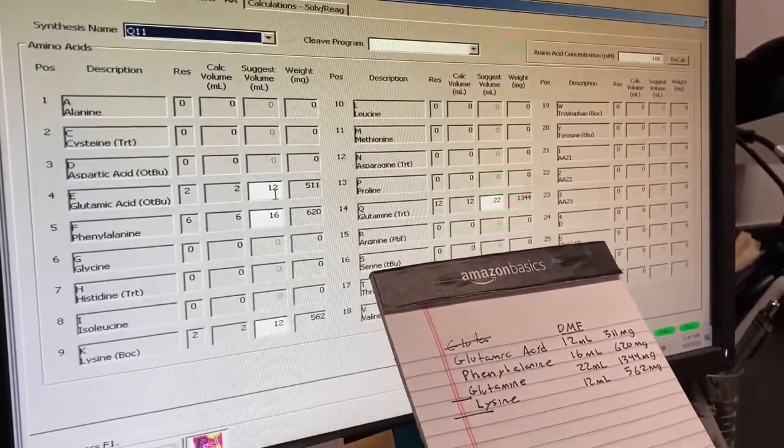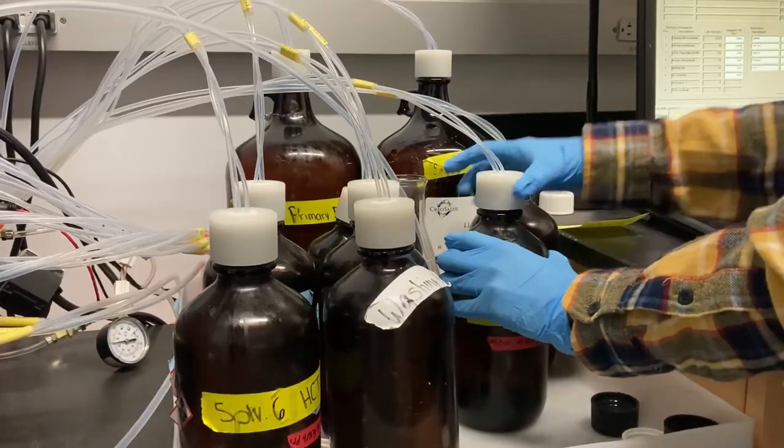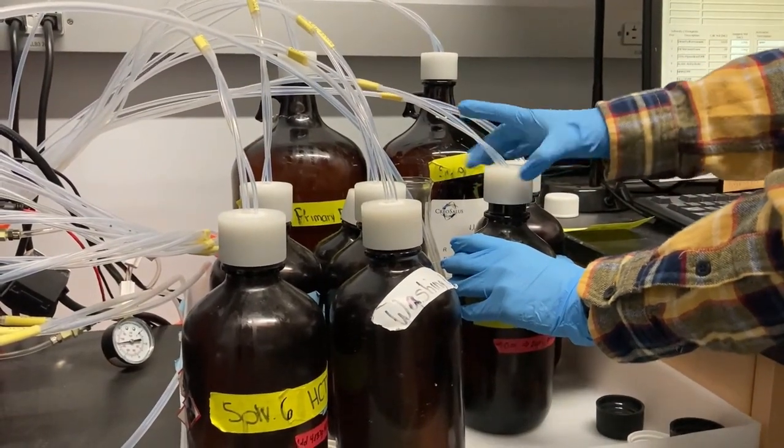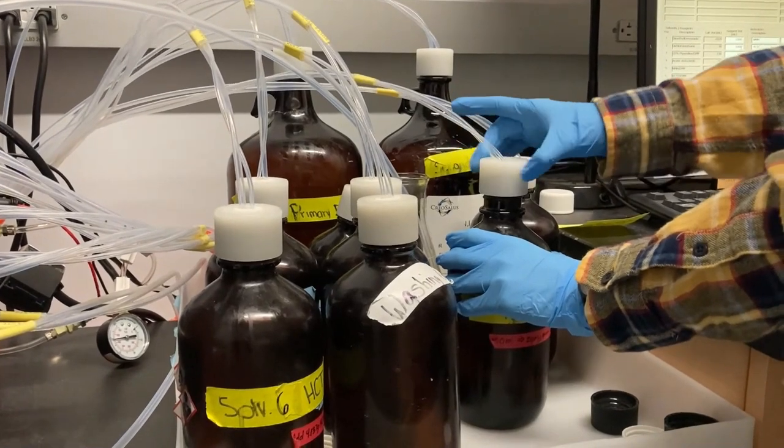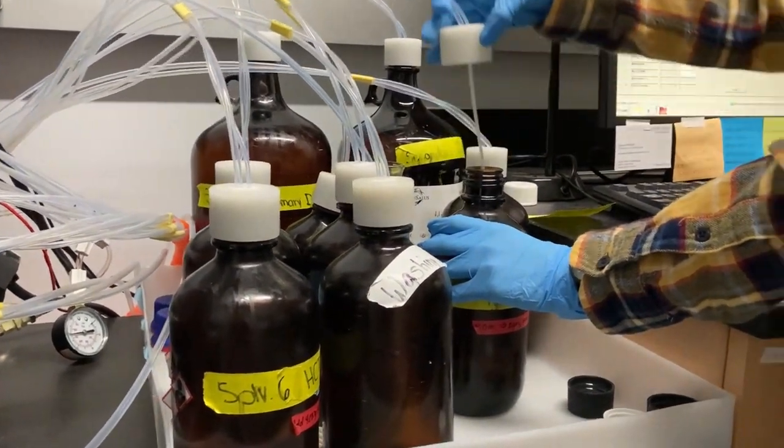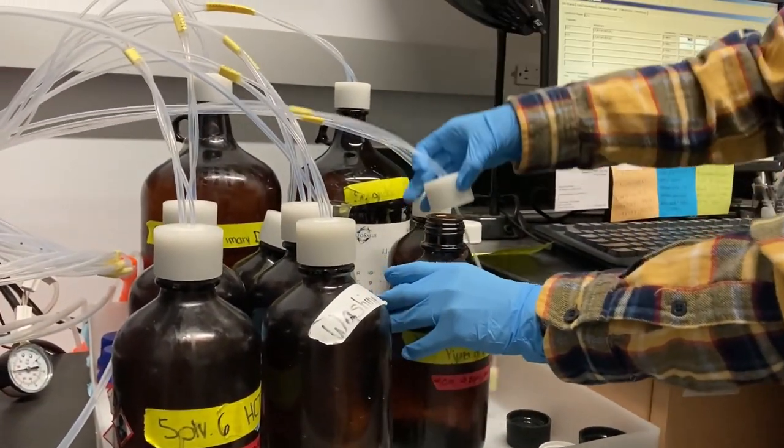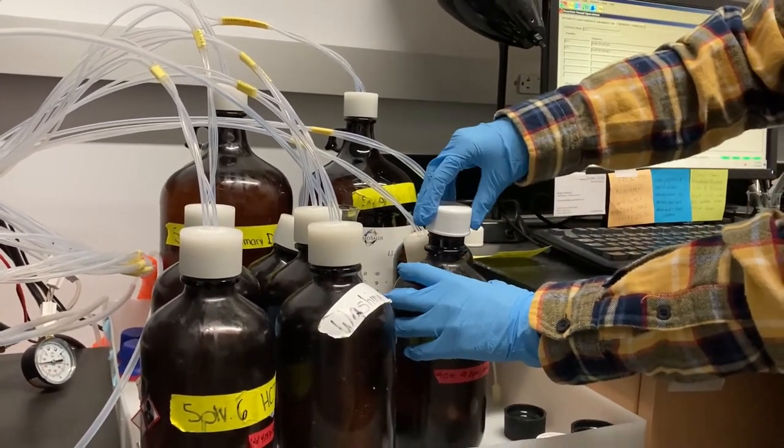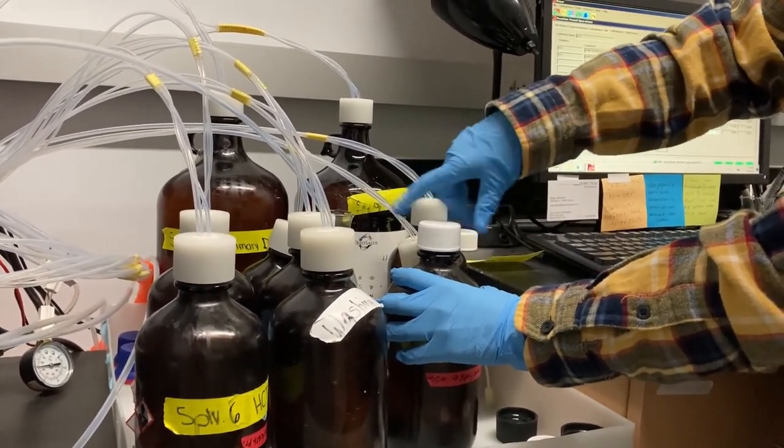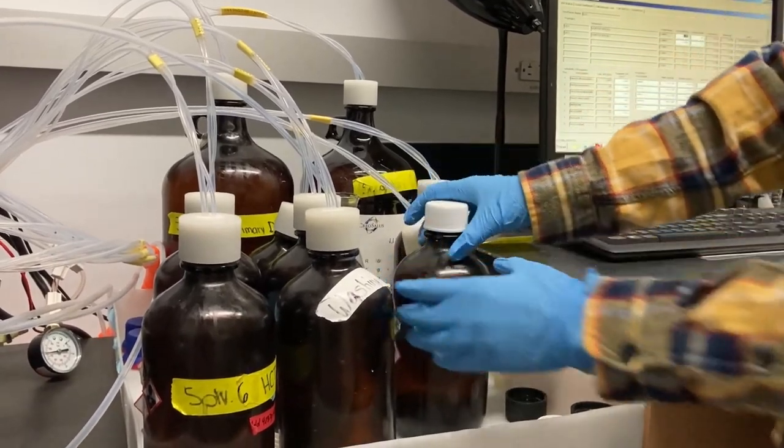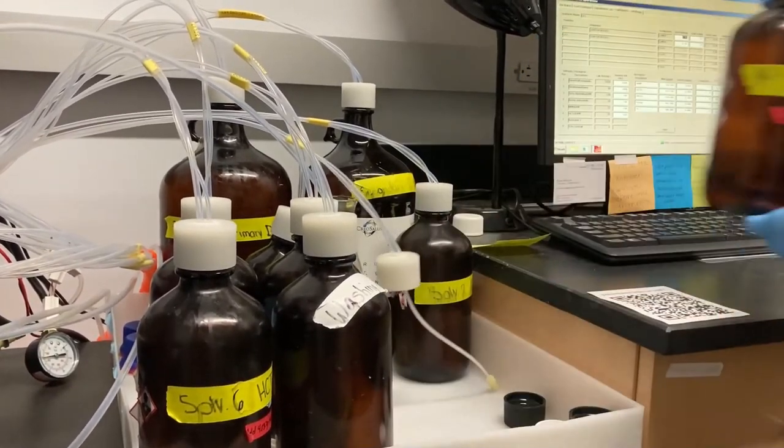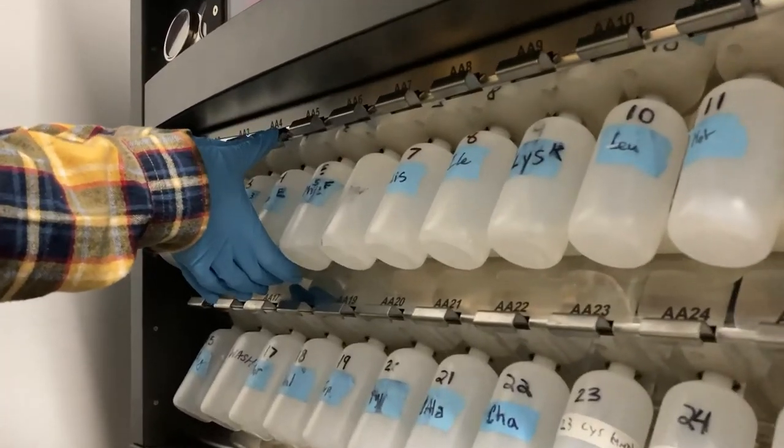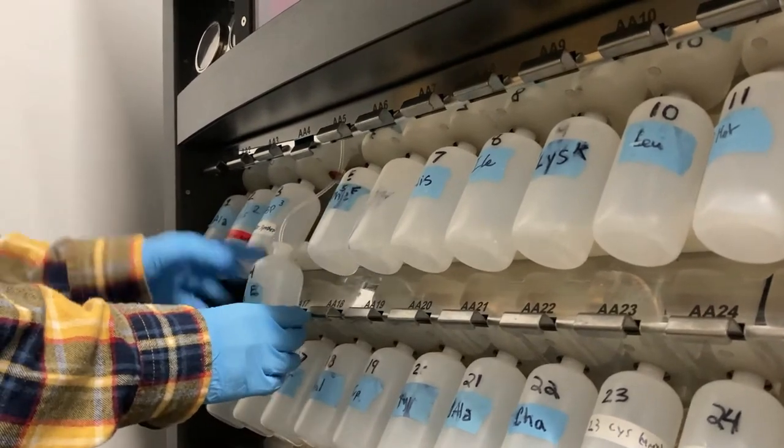Remove the reagent bottles that you need to refill. Bottle number 4, the capping solution, should have a wash bottle in place and the reagent bottle should be empty and set aside.